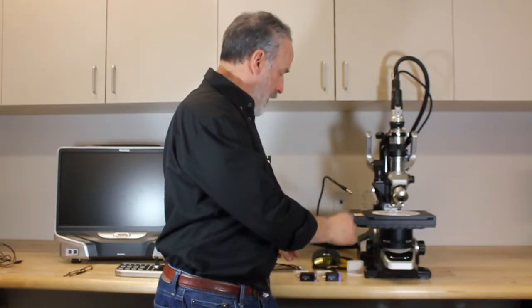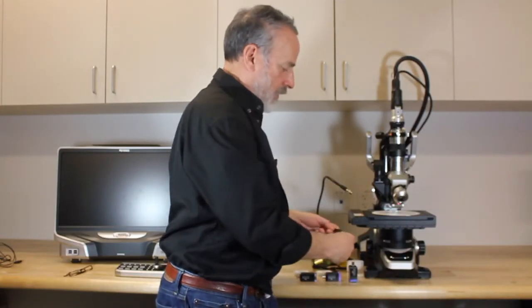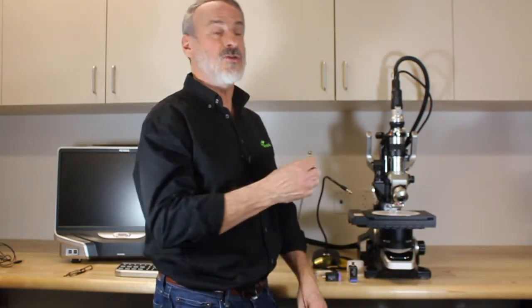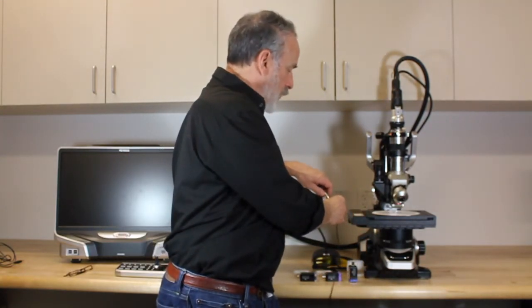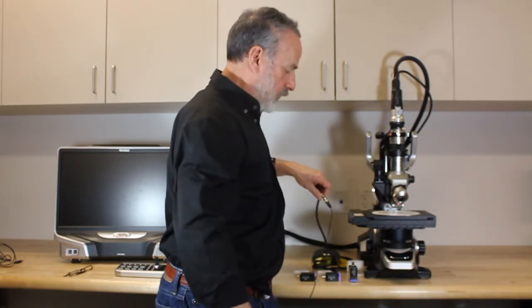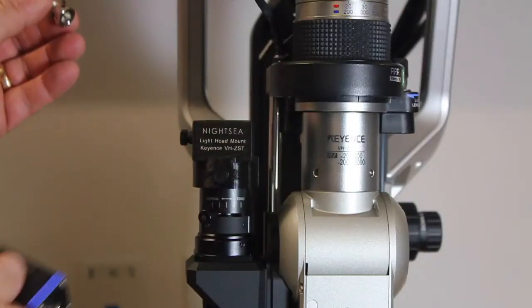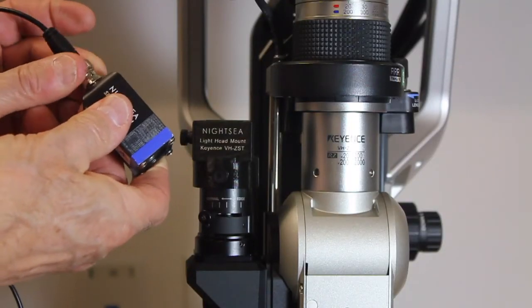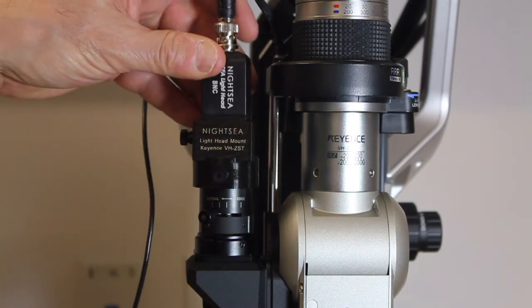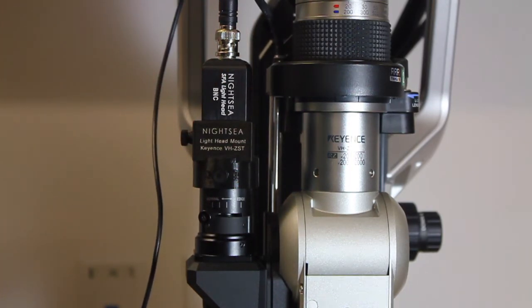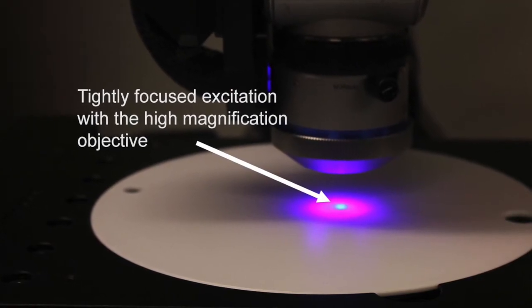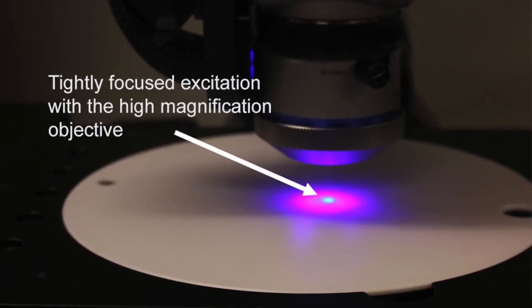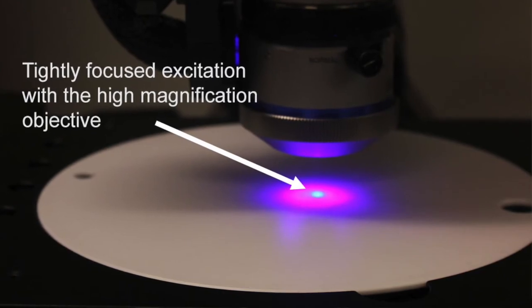The light heads will mount in that, but in order to get the electricity to the light heads, we have a cable. One end plugs into the gooseneck, the other end plugs into the connector on the light head. We can then insert that into the spot, tighten the thumb screw lightly, and that's now ready to go.